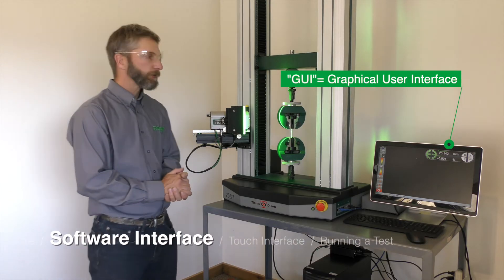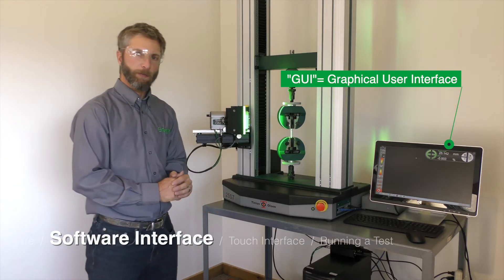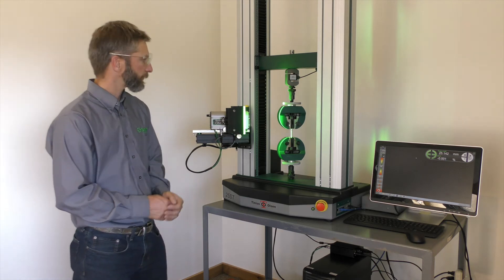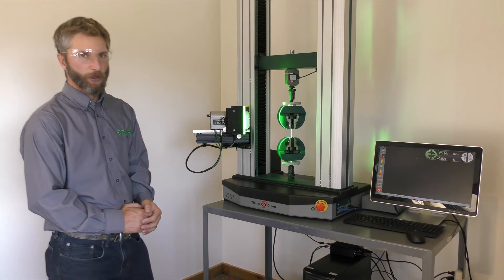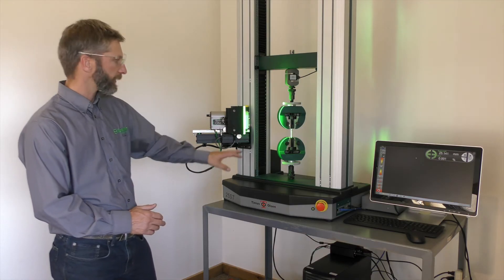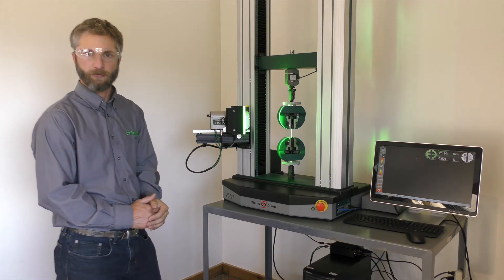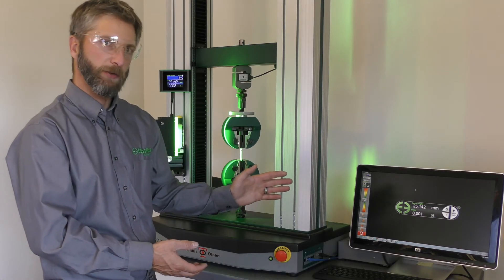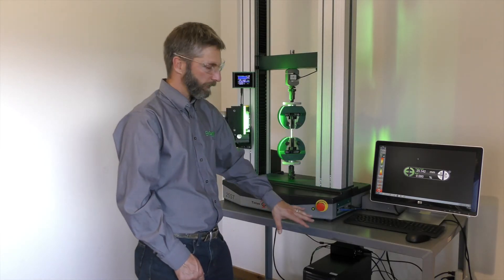The Epsilon-1's lightweight GUI takes up little space on the desktop, and it is not typically necessary to interact with it in between tests. Just wave your hand to begin the next test — the system's already operating. It is not necessary to select features in the image between tests in a typical application. The GUI software can operate on the same PC that your test frame is using, and does not require an additional monitor and computer.